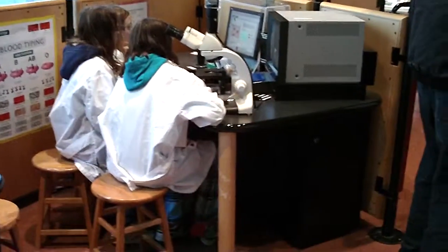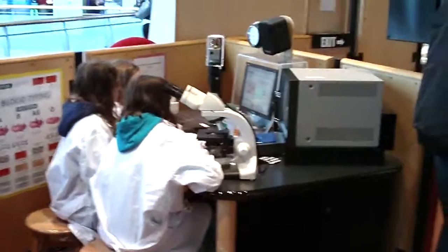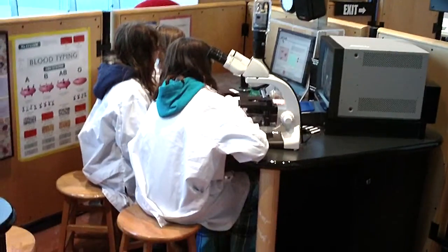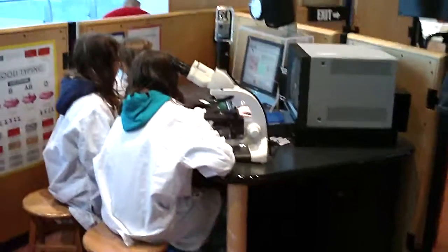That's what the cell lab does - you have fun doing different types of experiments and learning about the blood cell itself. That's the back lab where we do our experiments.